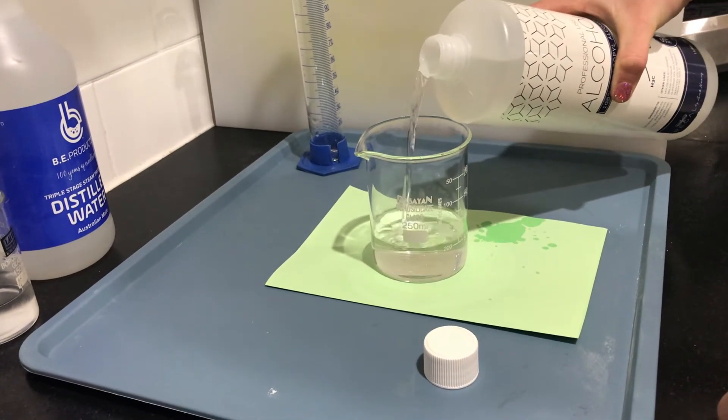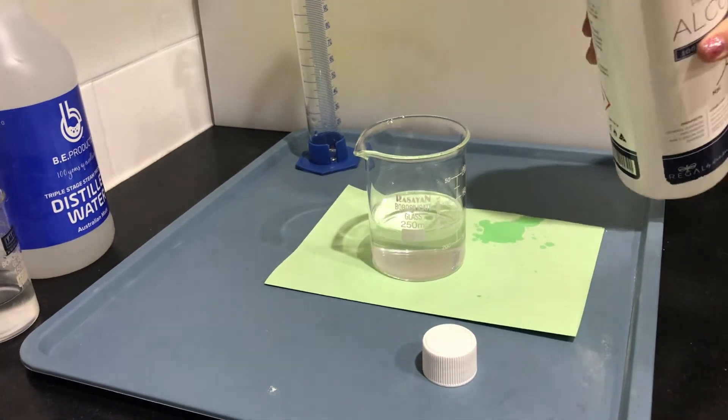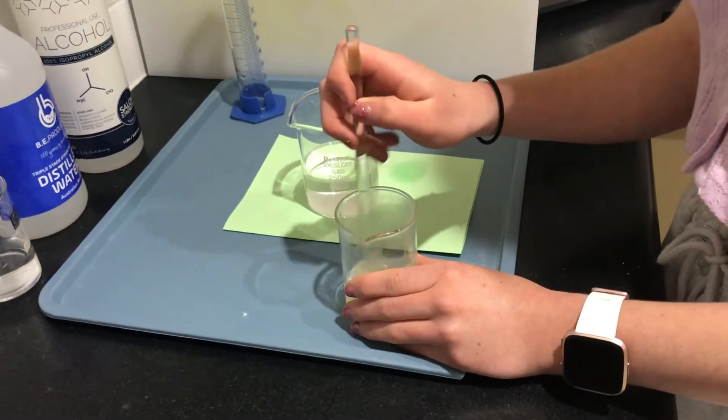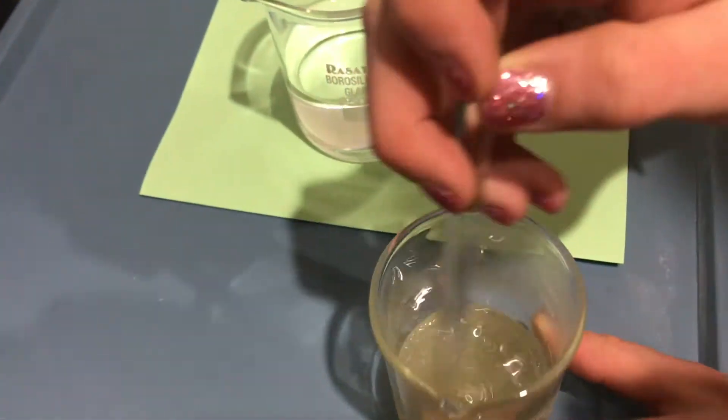Since calcium acetate is more soluble when it's cold, I put it in the freezer. While it was in the freezer, I poured 100 millilitres of isopropanol alcohol into a beaker. After multiple trips to the freezer and mixing the calcium acetate, it has finally dissolved.